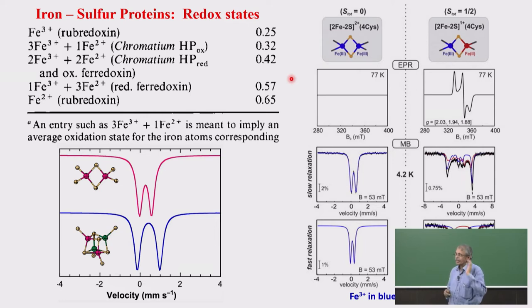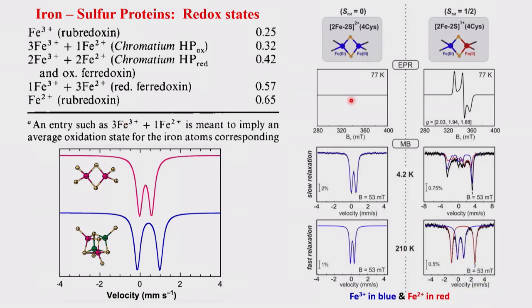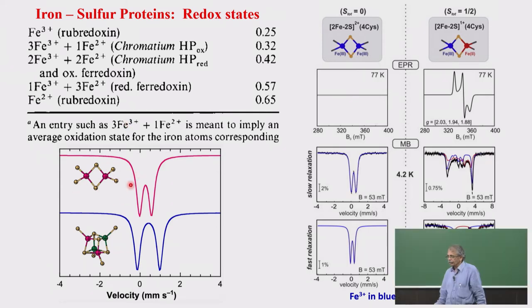So this means we can identify the redox states of the iron-sulfur clusters. Not only with EPR, using Mossbauer you can also find out what kind of oxidation states these possess. Now you can see here, for example, the 2 iron 2 sulfur and the 4 iron 4 sulfur clusters have differences depending upon their oxidation state. Now come to the right side panel of this particular slide, please.